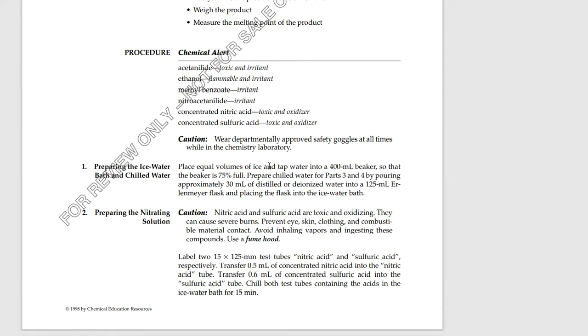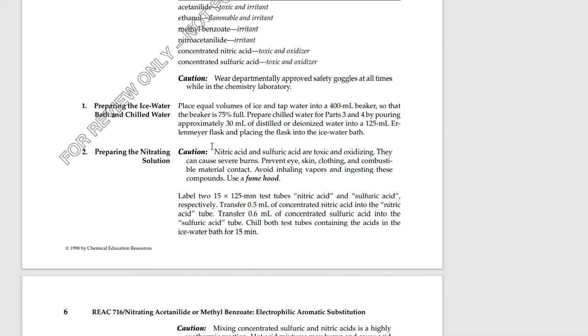So, in the directions, it says, caution, nitric and sulfuric acid are toxic and oxidizing. They can cause severe burns. Label 2 test tubes, one that says nitric and one that says sulfuric. Transfer a ½ ml of nitric, transfer 0.6 mils of sulfuric, and chill both of the test tubes in the ice water bath for 15 minutes.